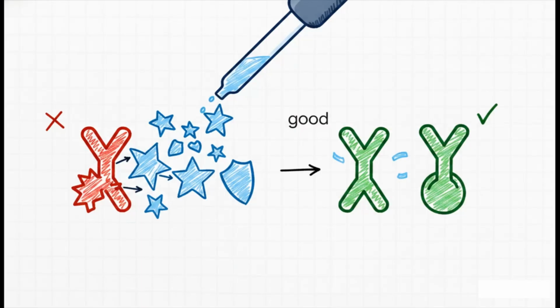Step 4 is all about strategy, not guesswork. Probe your blocker and diluent on purpose. I highly advise against vague blocker swaps where you just try every different bottle you can find. Instead, use a matrix-informed panel. Your goal here is to preferentially suppress the false positive subset while completely preserving the true recovery of your actual analyte. You want to strategically increase the discrimination between the real signal and the interference.